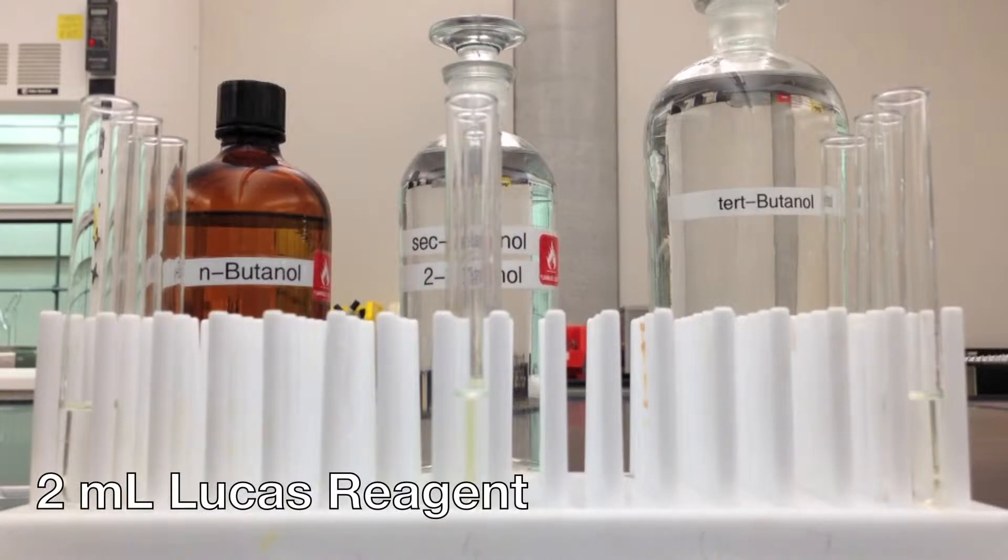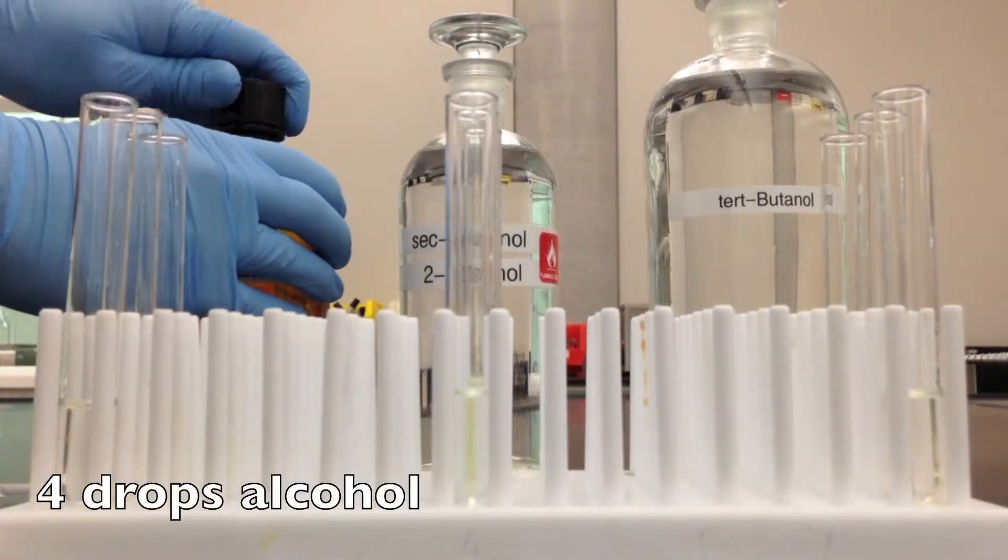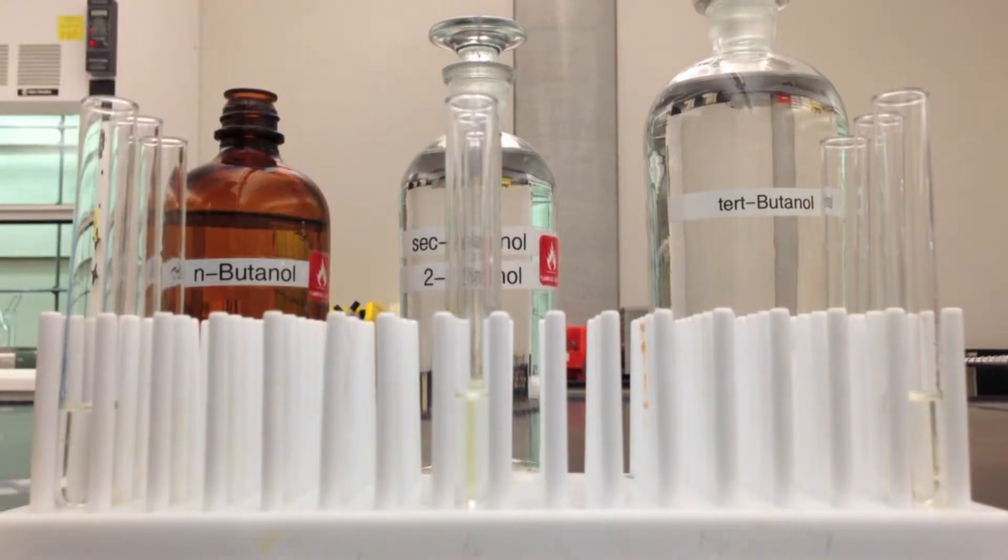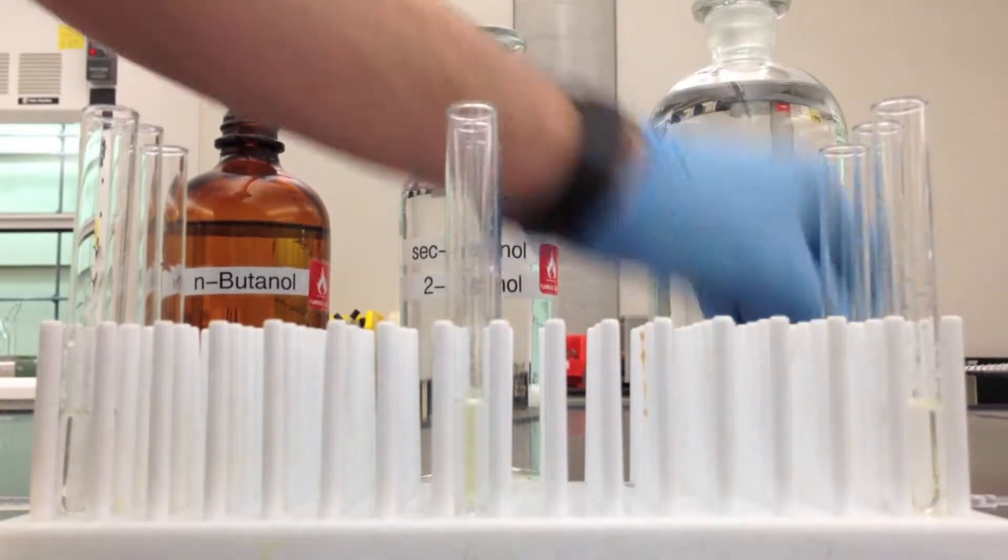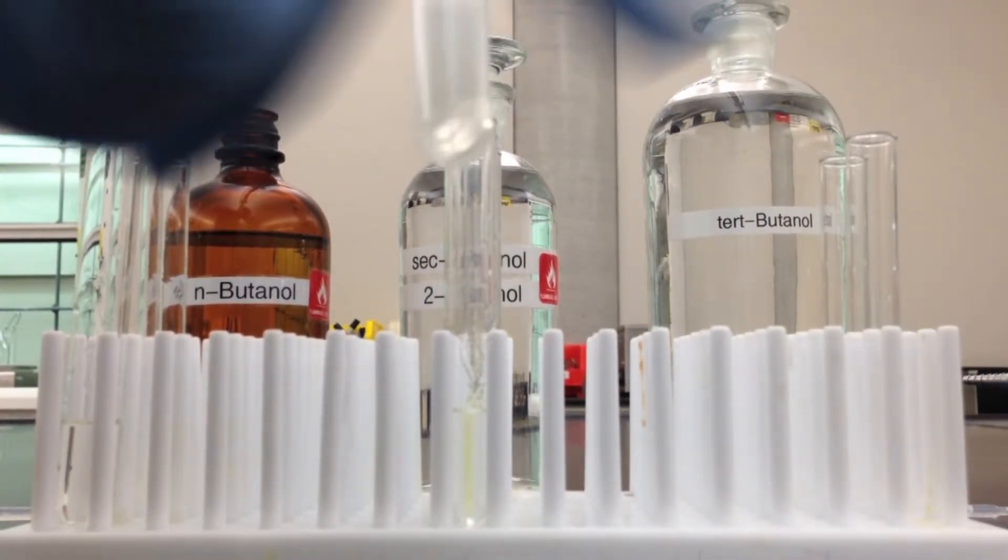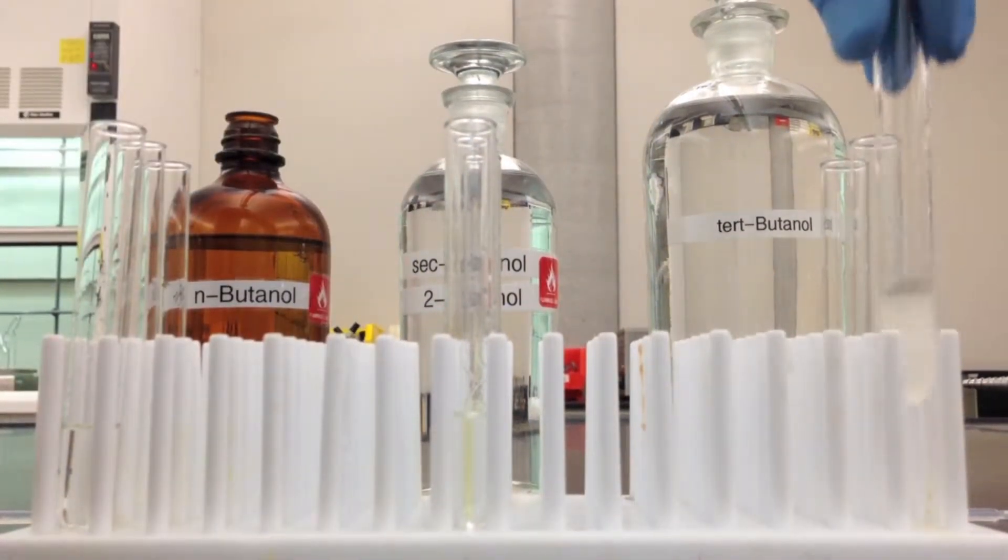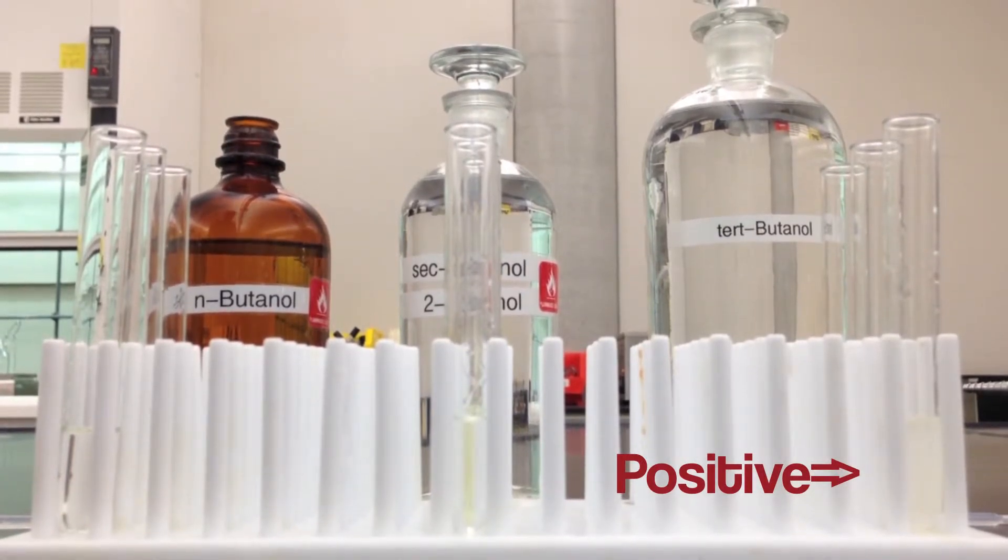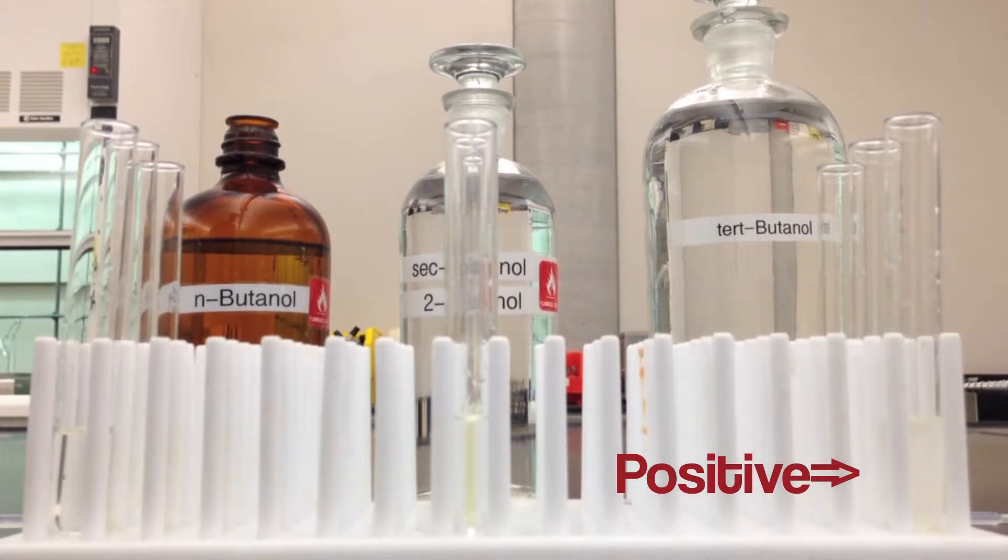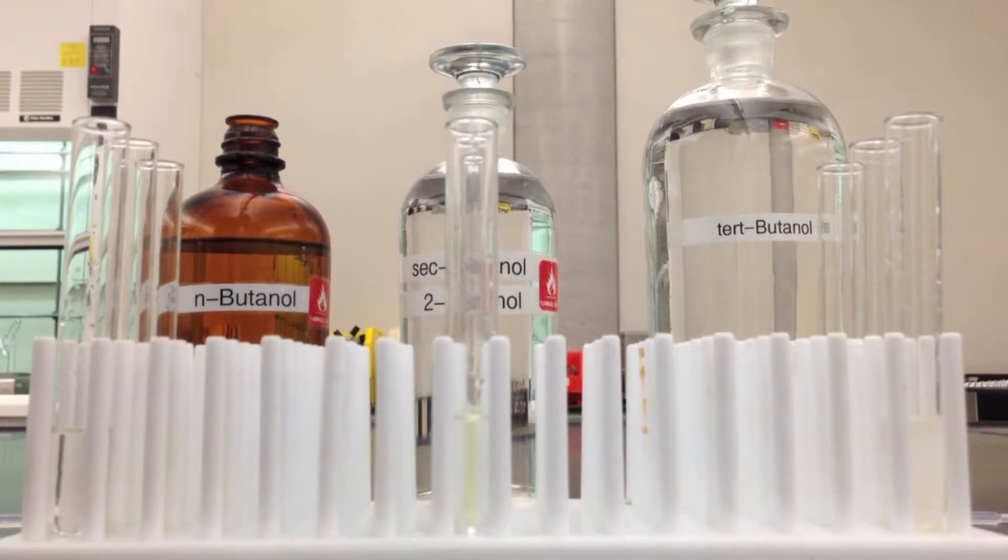So we've already added two milliliters into each test tube. And now we're just going to add roughly four drops of the unknown of each one. So here we have an immediate reaction, which as I said was what a tertiary alcohol would do. And within 15 minutes, if another one of these reacts, then we know that that might be the secondary alcohol.